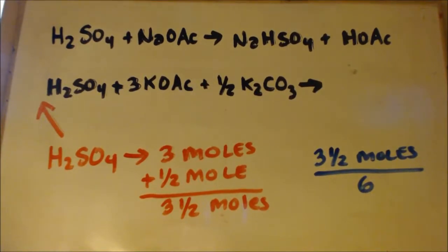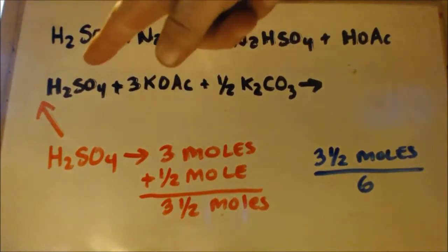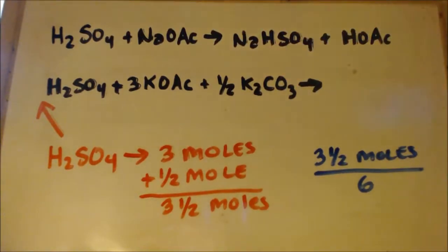But keep in mind, if you do that, an acid and a base makes salt water. So if you do this, you can't make glacial ethanoic acid. You know what I mean? It's going to have some water in it. But if you don't mind having a little bit of water in it, you can easily just do what I'm saying, but you have to be careful. It does liberate CO2, and you don't want it to foam up and get out of control.